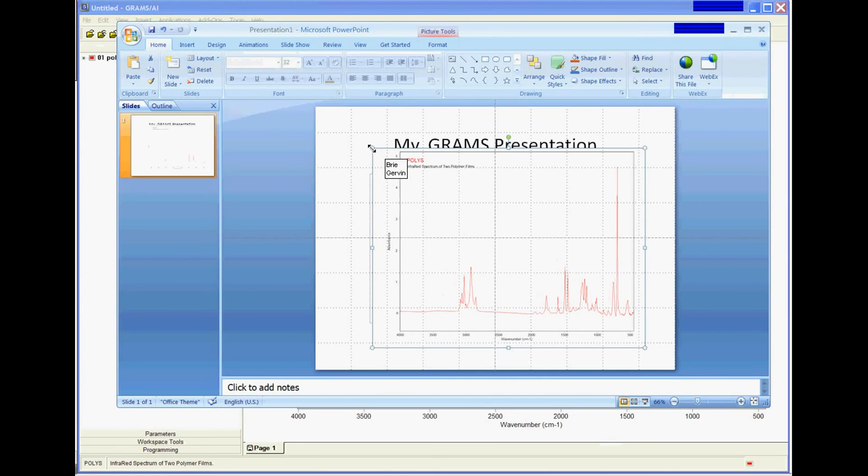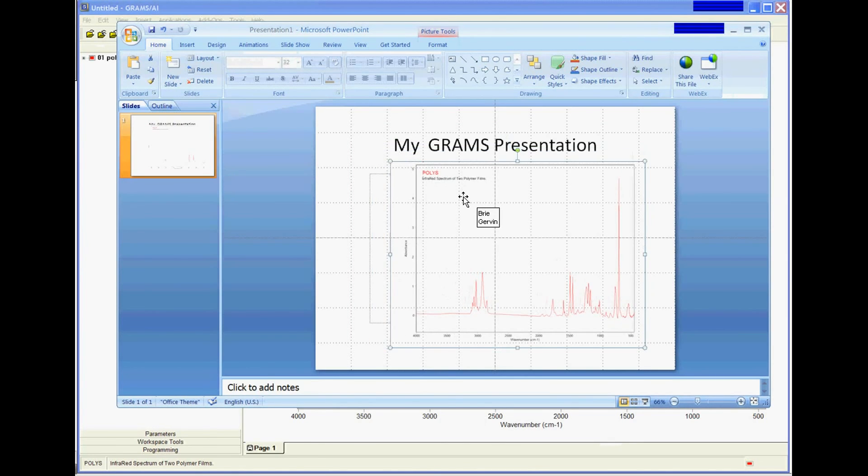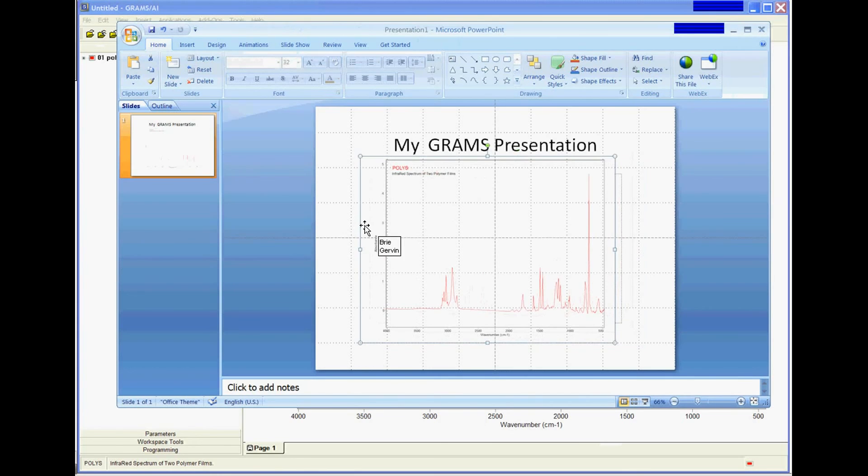Make it a little smaller, fits a little better on my slide. And now I have a nice simple graphic to use in my presentation.